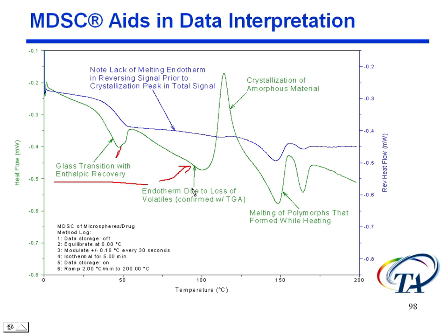All of a sudden, we see this large exothermic peak. Now, with pharmaceutical materials, sometimes you'll get polymorphic phase transitions, where a material melts and recrystallizes to another crystalline form. But that's not what's happening here, because we never see any melting in the reversing curve, all the way up to where we see the crystallization in the total heat flow. We never see any melting endotherm. So that means this is crystallization of amorphous material.